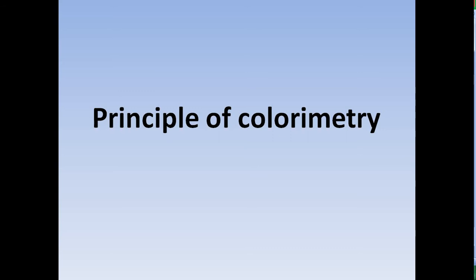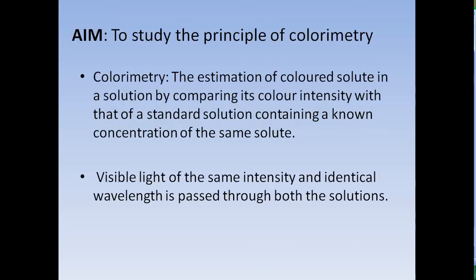Today we will discuss colorimetry and its principles. The aim is to study the principles of colorimetry.